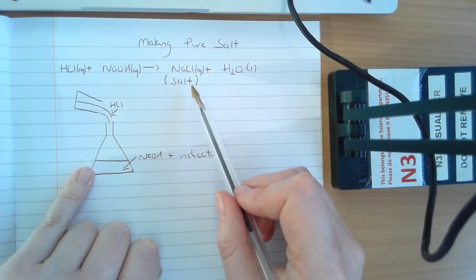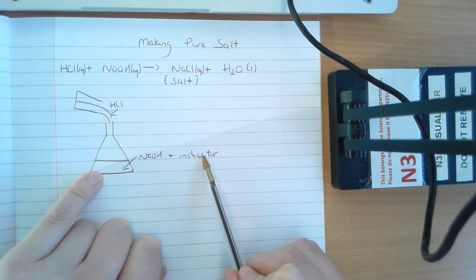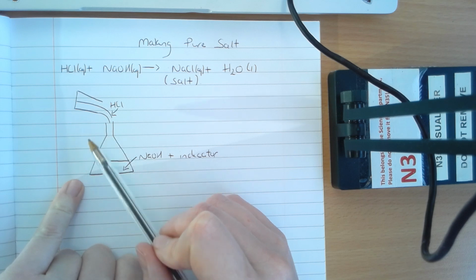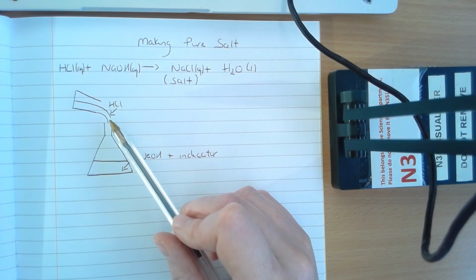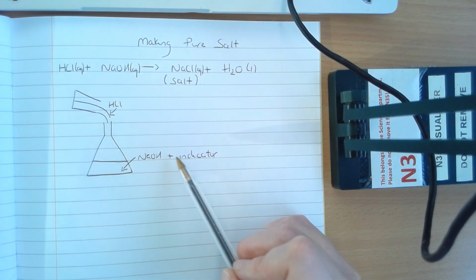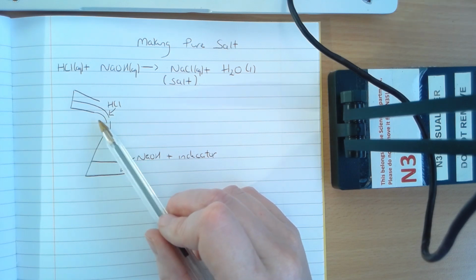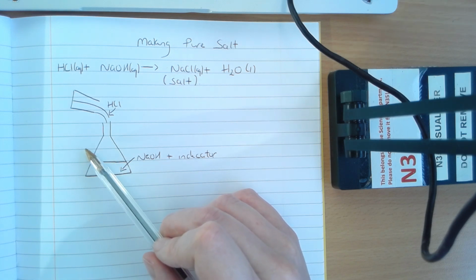Okay, so if I had my NaOH, my base, in a conical flask with an indicator, and I tried to just pour the HCl in from a beaker, even if I did this slowly, pour in a little bit of HCl, give it a good swirl, pour in a little bit more, give it a good swirl, I don't have enough control when I'm pouring from a beaker to be able to stop at exactly the point when that indicator changes color. I am definitely going to add too much HCl. And once you add excess HCl, you've got no way of removing it again.